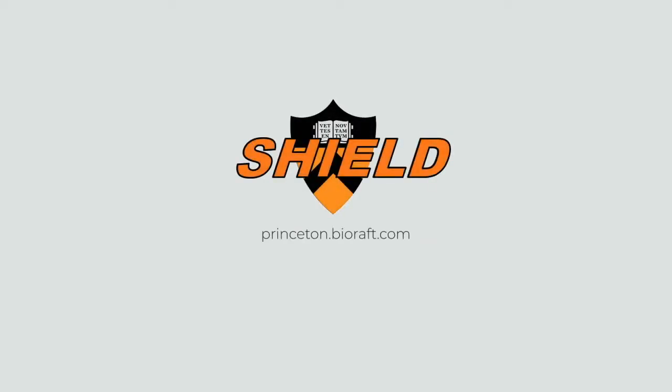Welcome to the Safety, Health, Inspection, and Equipment Logistics Database, or SHIELD, Princeton's one-stop resource for laboratory compliance and data management. The next series of videos will lead you through setup and configuration of your research group's pages within the SHIELD system.